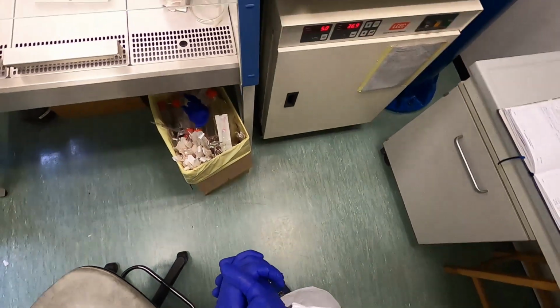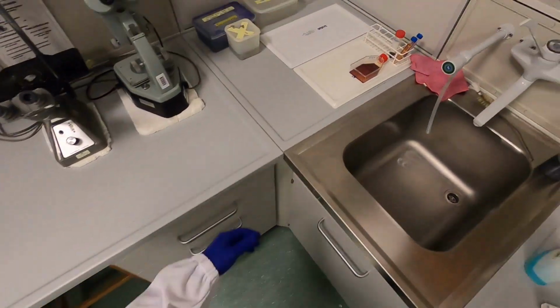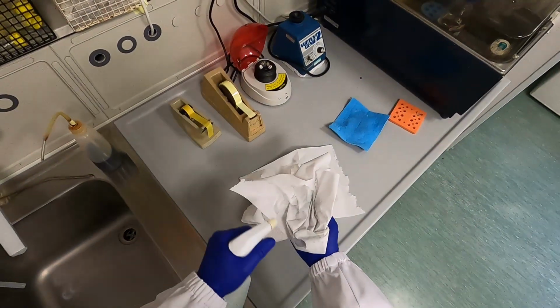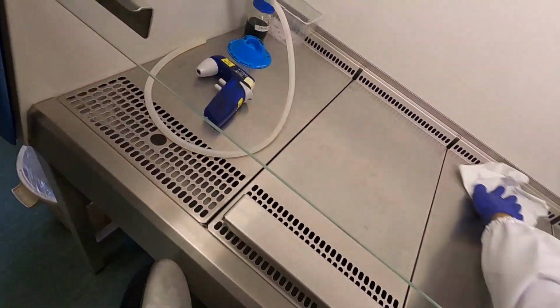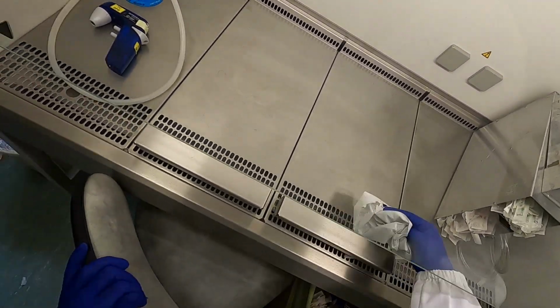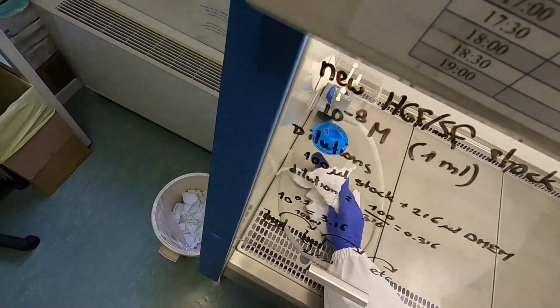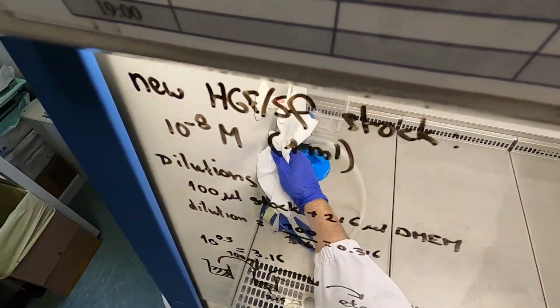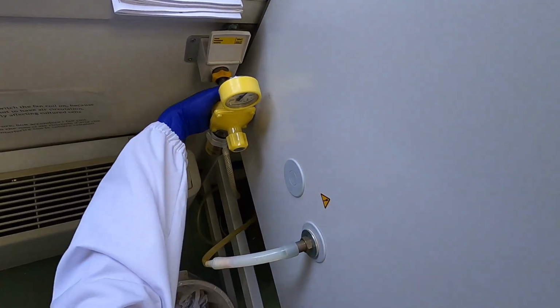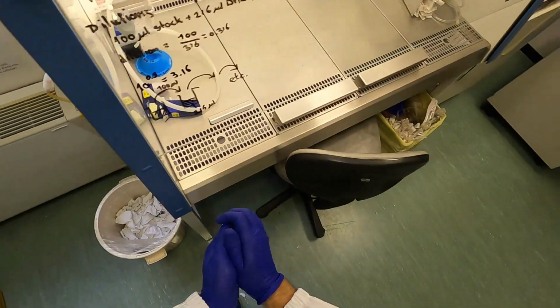Last thing to do is just to clean up and leave the hood, the laminar flow hood, in a very clean and nice way for the next user. So we just wipe it with ethanol. Maybe we should also remove the writing. Switch off the vacuum and get rid of those gloves.